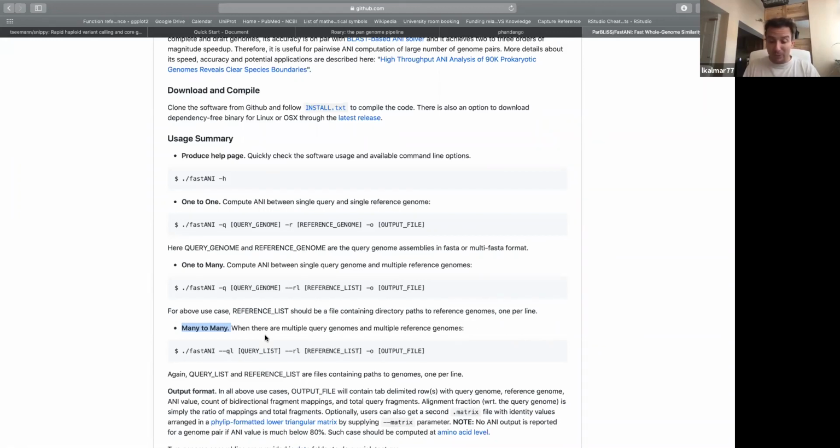You may remember that if you have a fragmented genome at the end of your assembly, so your genome is not within one contig but in multiple contigs, and you are looking for a k-mer match that is on the boundary of two contigs, then you won't find it.